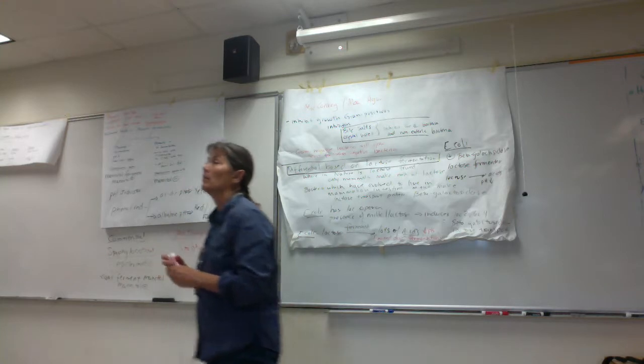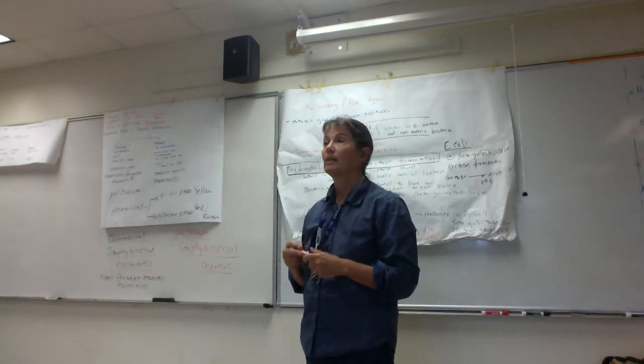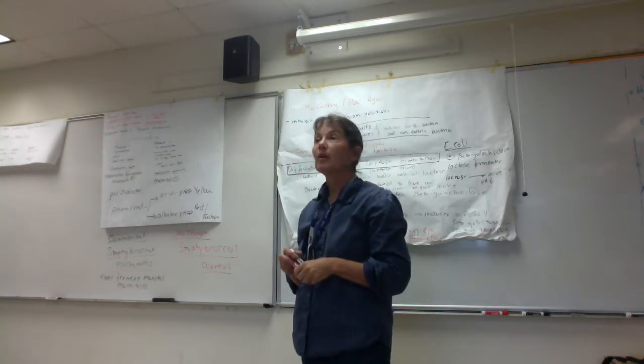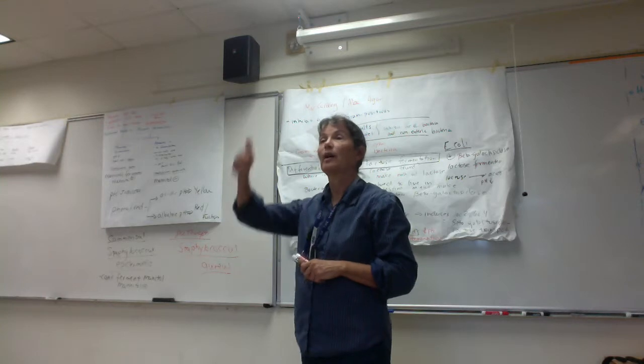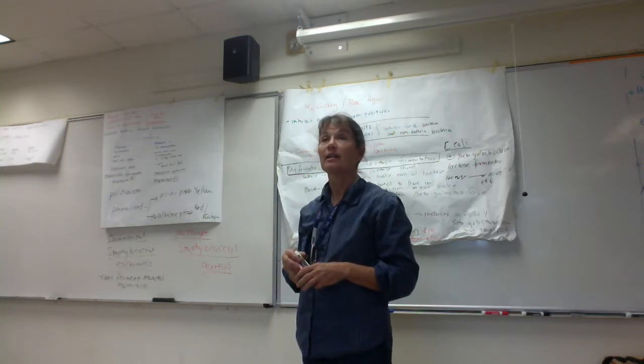And what do we know about ammonia, you guys, with regard to pH? It's a weak base, right? So it'll bind hydrogen ions. So what's going to happen to the pH if amino acids are torn apart? Will the pH go down or go up? It'll go up, right? We'll get an alkaline reaction, yeah?